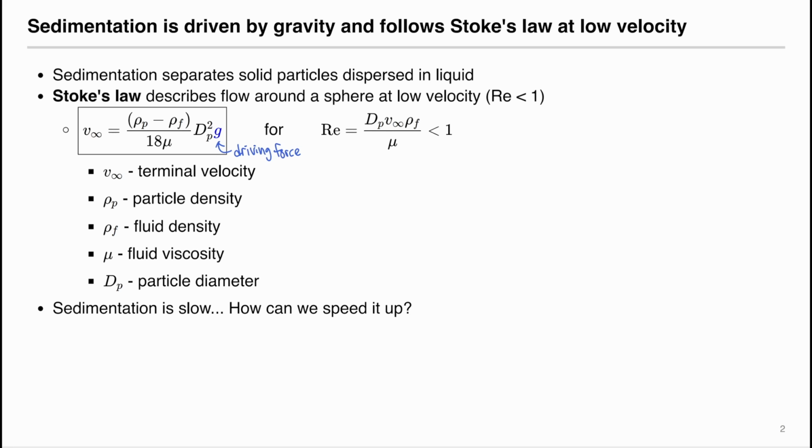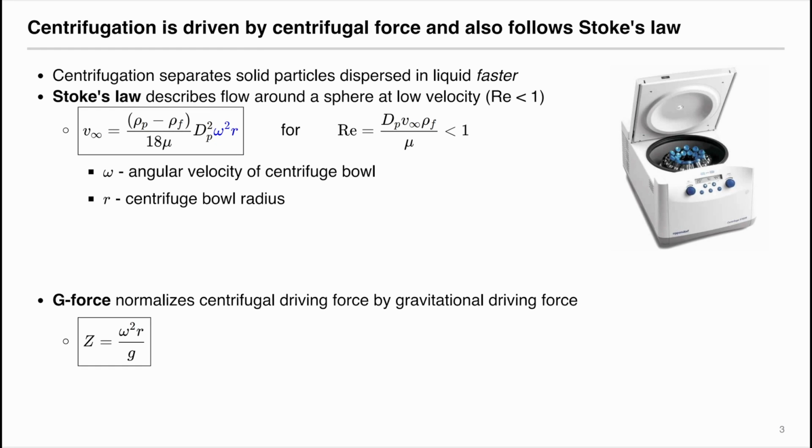However, from our intuition from daily life, sedimentation is very slow, that is, the separation of solid particles dispersed in liquid only by gravitational force is pretty slow. And how can we speed it up? We speed up the separation of the solid particles in the liquid by using centrifugation.